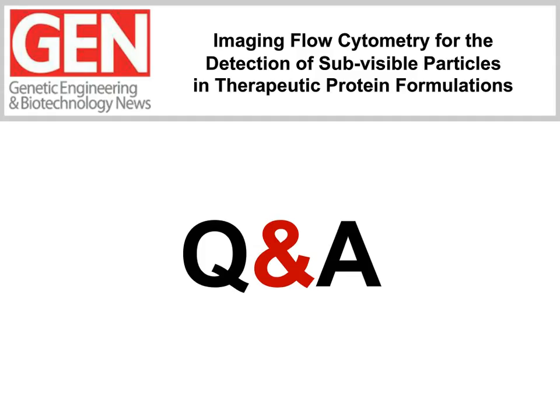Yes, we have tried that because we realized that some researchers might want to not use fluorescent dyes in order to identify their particles, which is very similar to what's done using flow imaging techniques like MFI. The challenge we faced here was basically that we had higher amounts of background counts using the bright field channel and also the side scatter channel for a particle-free control sample. And what this means is that you have to start applying a threshold in order to detect what's your particle and what's background. And ultimately, we found that setting this threshold would possibly remove some of your particles of interest by counting them as noise.